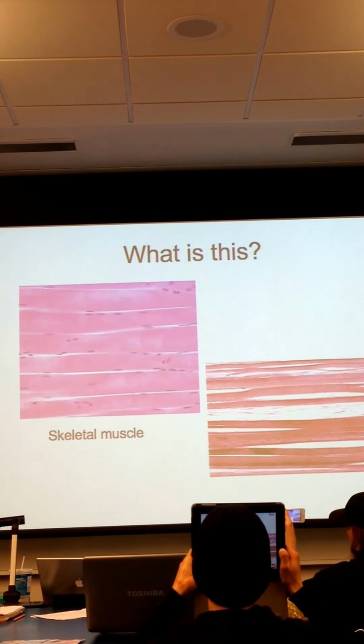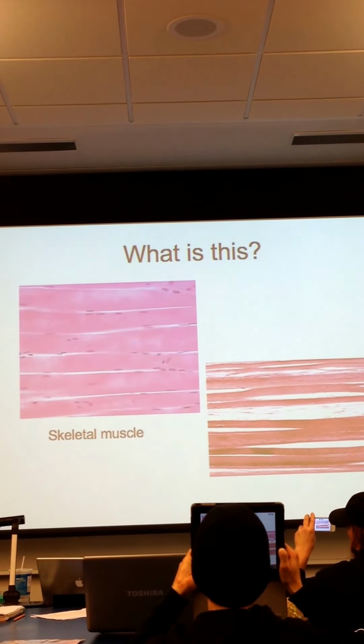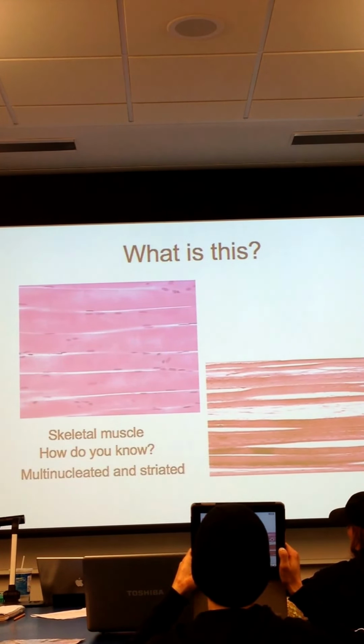It is skeletal muscle. Remember, you had the two types of skeletal muscle you needed to look at. Again, it's multinucleated, all the little purple guys, and you can see all the red ones in here, and it's striated. So the things that someone thought were intercalated discs are actually the striae. I'll point out the distinctive difference when we look at cardiac. But this is skeletal. You can tell it's not cardiac because it's not branched, and it's big. That's the entirety of this slide.